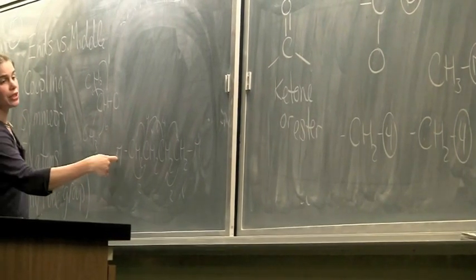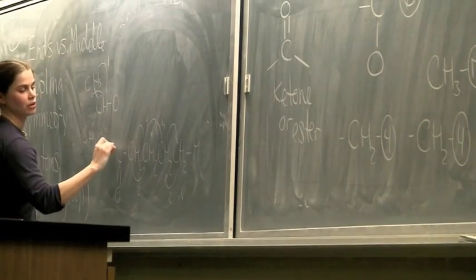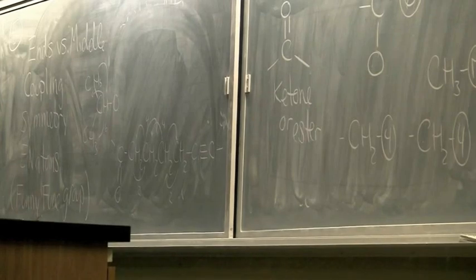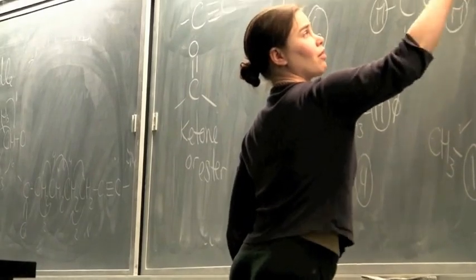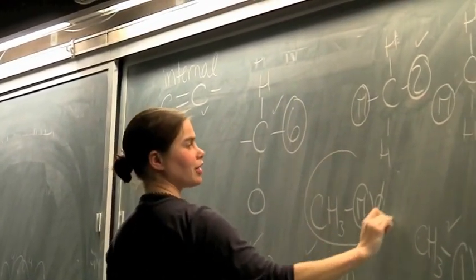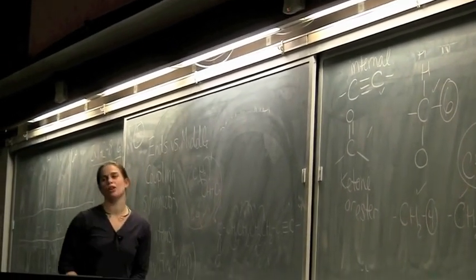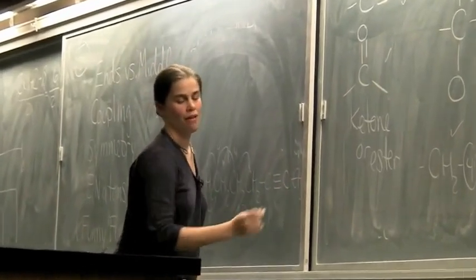So one of those is the ketone, C double bond O. And one of those has to be the alkyne, triple bond C. At this point, we've used up most of our pieces. Only thing we're missing, CH3 on one side, and we have to attach this oxygen on the other side. We said we had an ester or a ketone, must be an ester. We put the CH3 next to the alkyne. There's our molecule.